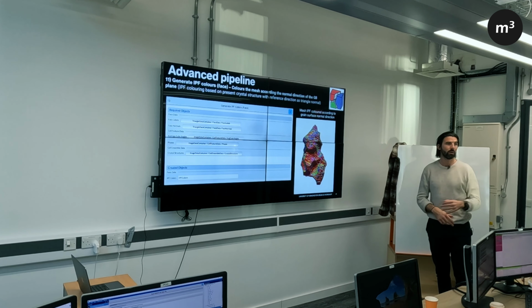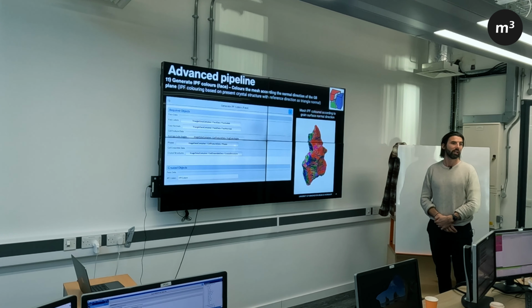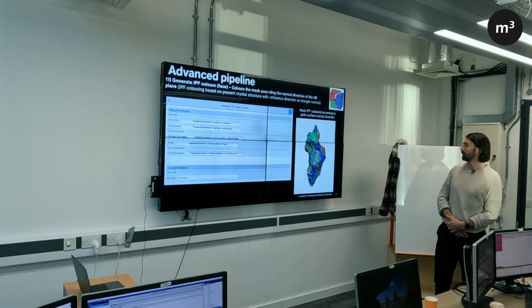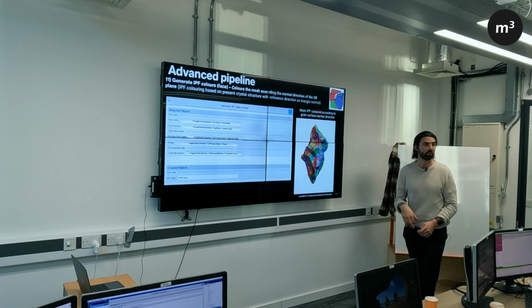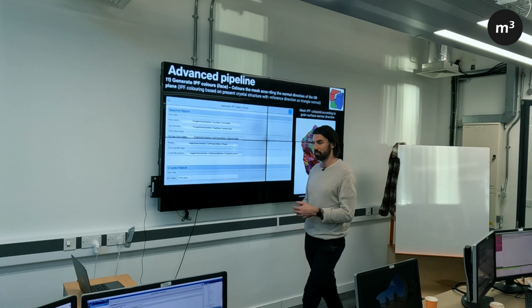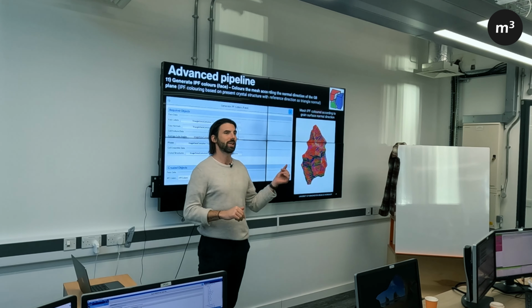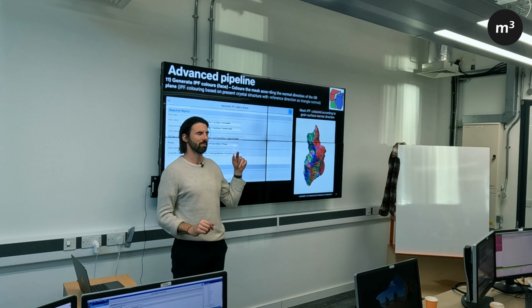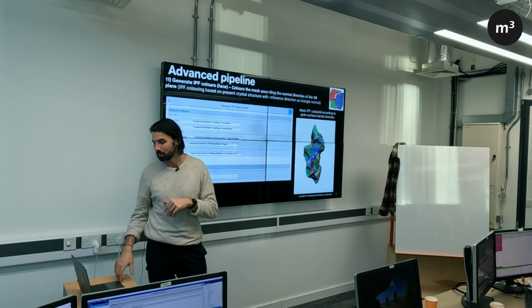And that's good for Jacopo, I think, for when we're looking at trying to improve the alignment between Z slices. This really shows it up quite nicely. We see this systematic shift in the IPF colouring. But yeah, that takes a while for you to get your head around what that colour's actually showing. It's IPF colouring, but your reference direction is your grain boundary normal.